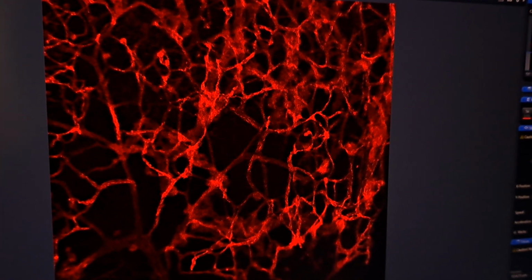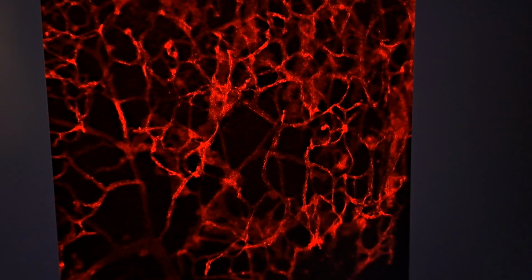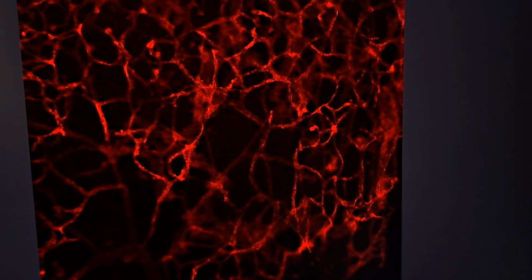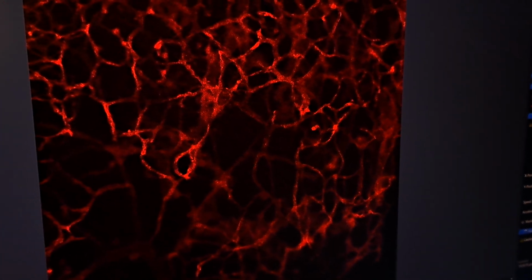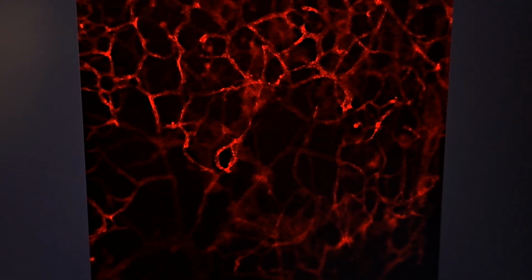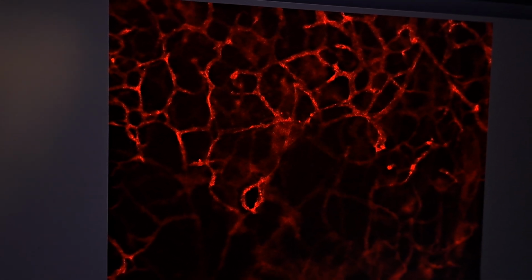We can compress it all at any time later to look at all the layers at once, or we can pull out groups of layers from this as separate photographs. There's all kinds of options. It can even be played as a movie that scans through the depths just to visually show you the three-dimensional structure. So we've gone through the intermediate. Some of the intermediate is now disappearing as we get deeper into these bright remaining areas up here. We're getting into some deep vascular plexus.